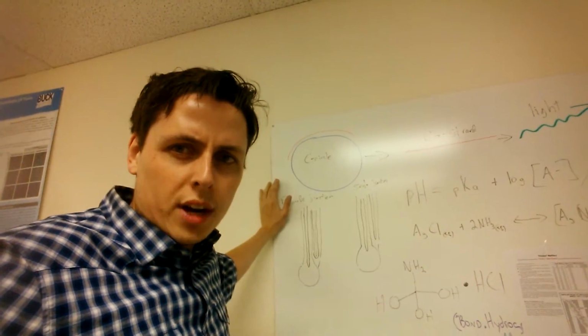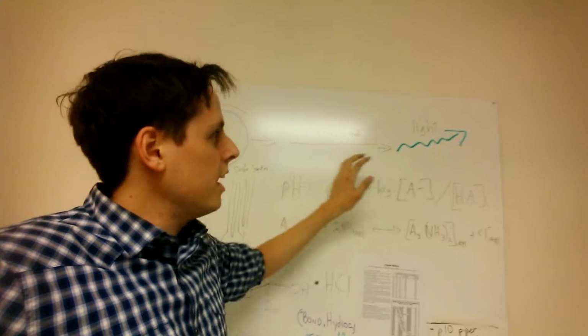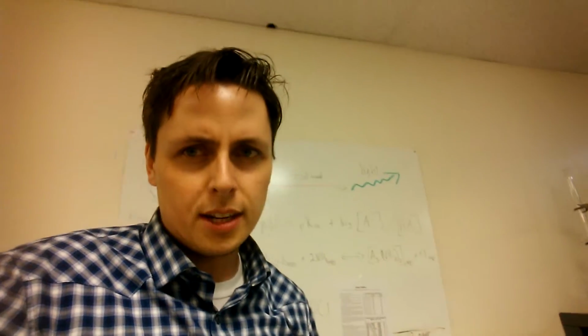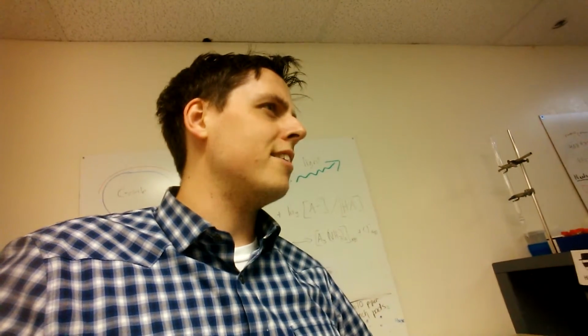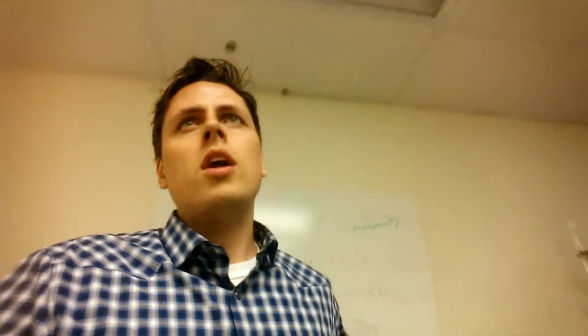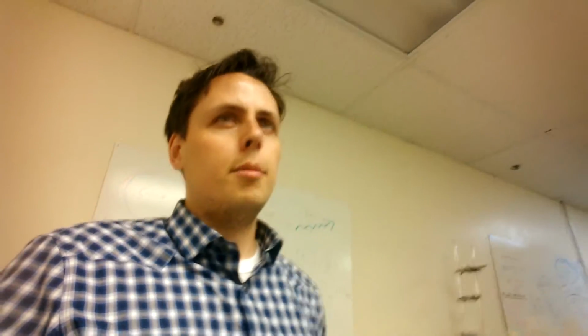So there's a 4-day assay that I do where I convert the C-circle into something called a G-strand, and then I measure light that gets output. It's a lot more complicated than that, but I've condensed it just to explain this particular problem that I encountered. This is a really tough assay, and there are so many ways for it to go wrong. One of the ways for it to go wrong is to have the wrong pH.